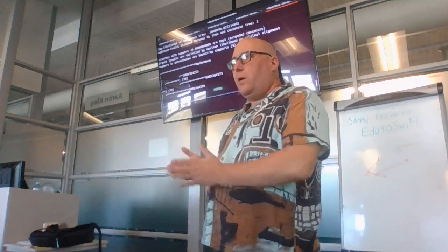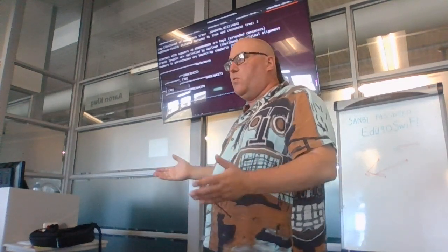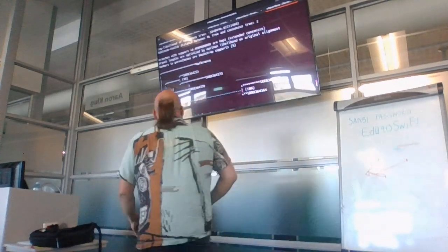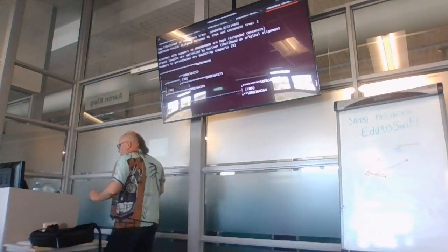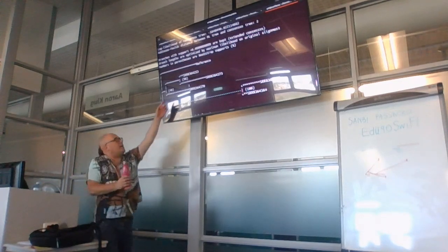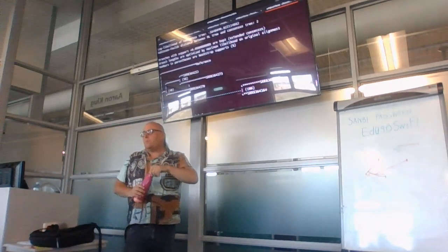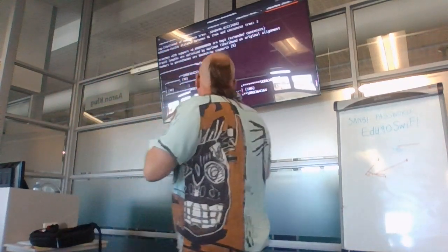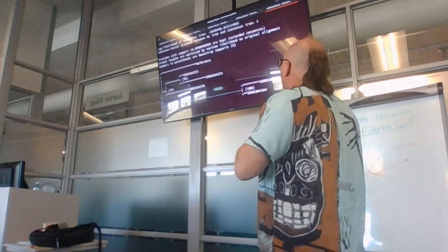This is, of course, a very small phylogenetic tree, just because I didn't want to take up the whole day running Snippy and things like that. Okay? The numbers in brackets are your bootstrap support. And then when you look at the one that says 100% and the one that says 40.